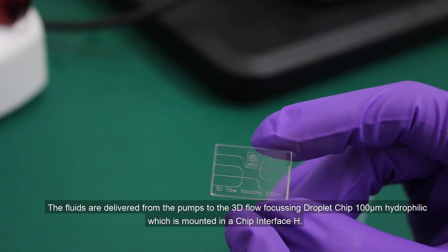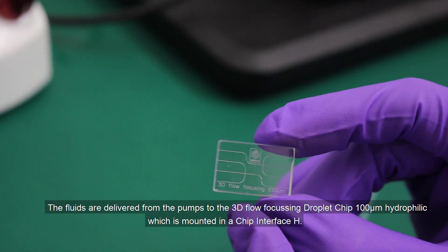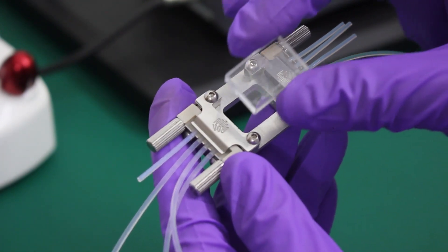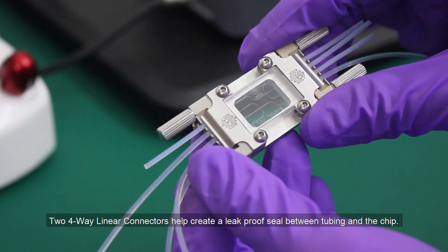The fluids are delivered from the pumps to the 3D flow-focusing droplet chip 100 µm hydrophilic, which is mounted in chip interface H. Two four-way linear connectors help create a leak-proof seal between the tubing and the chip.